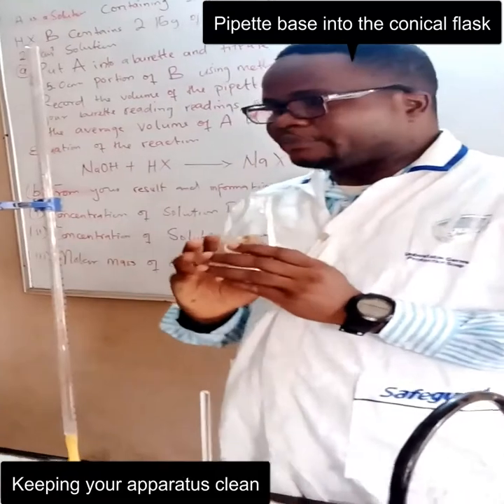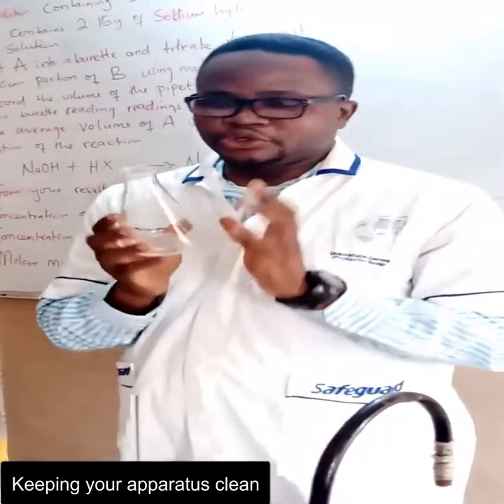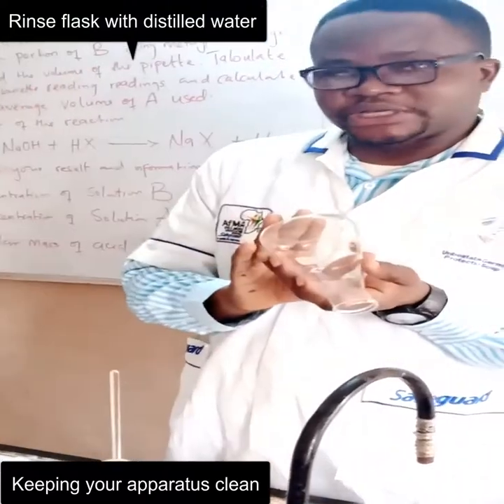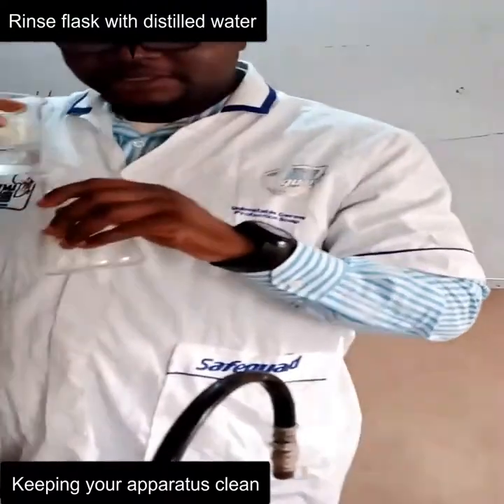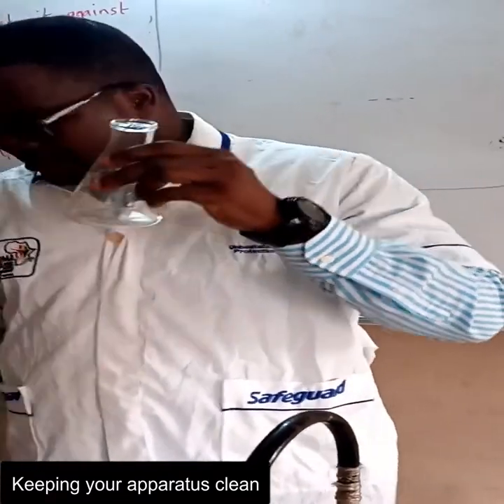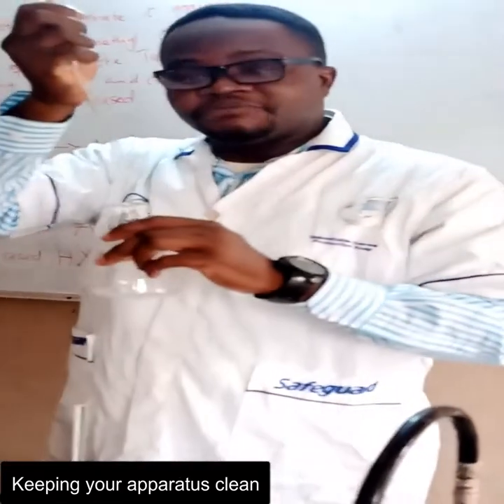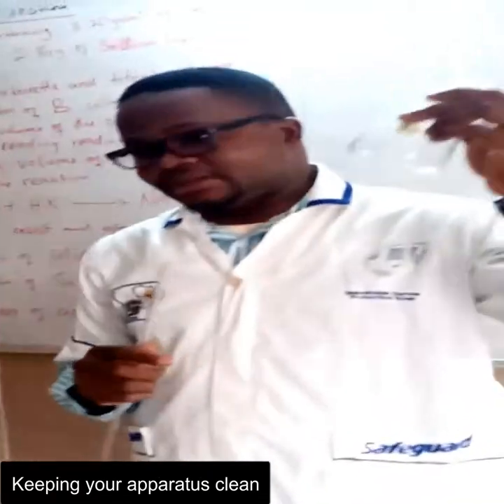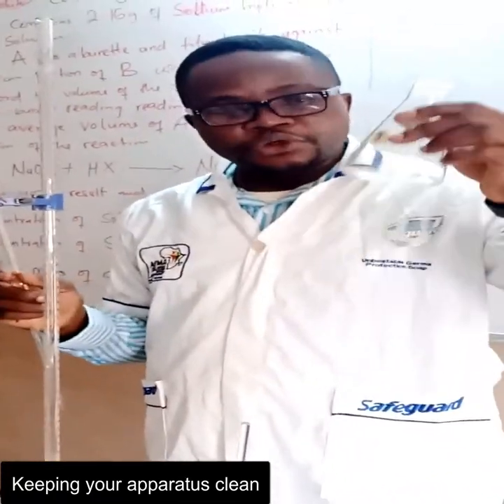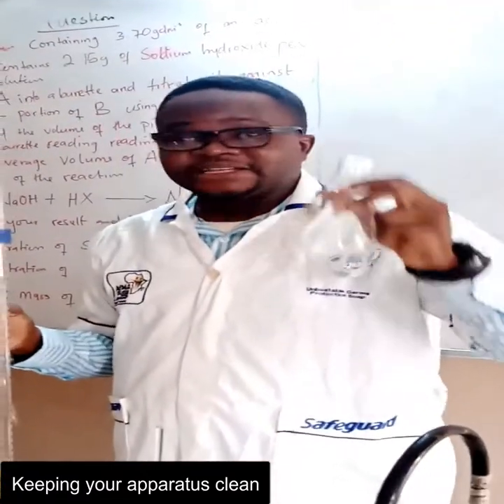The conical flask holds your base. But just opposite of the buret, you do not rinse your conical flask with base — you rinse your conical flask with distilled water only. If you go ahead to rinse this with base and have a droplet of base here, and you use your pipette to take 25 ml, by the time you add 25 ml you'll be having more than 25 ml inside. That is why the titer value differs. You rinse your conical flask with distilled water and distilled water only.